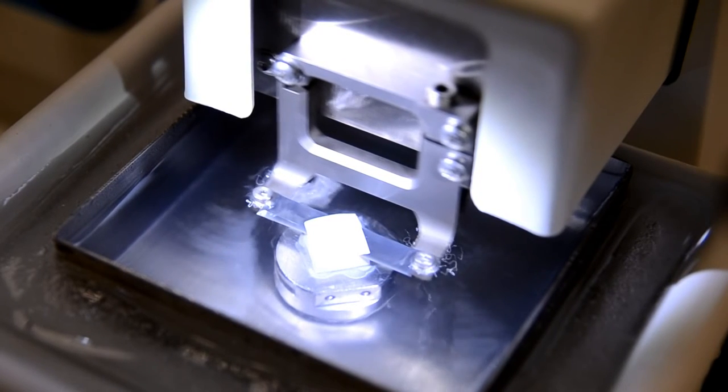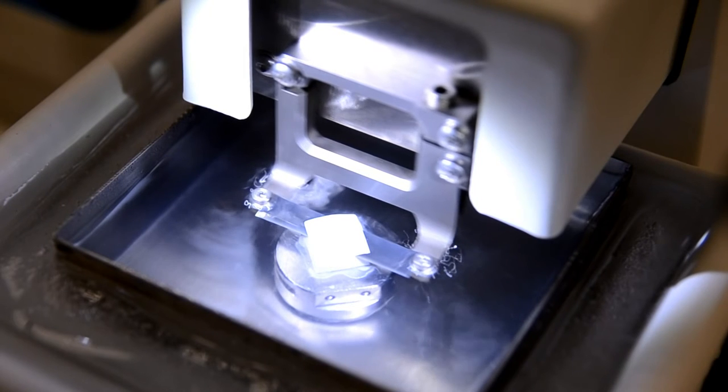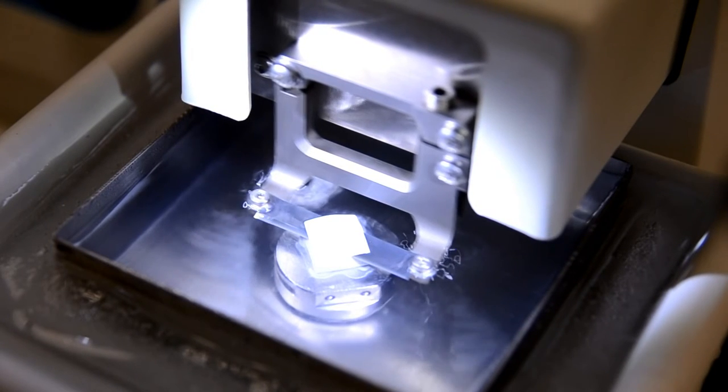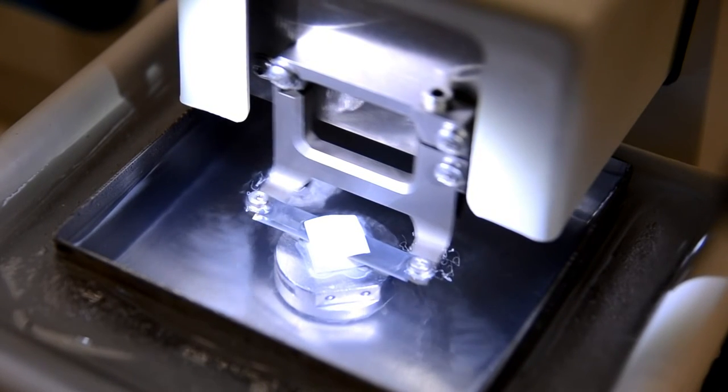It also permits you to cut several slices before harvesting them from the bath. This is very useful when cutting slices in automatic repeat mode.